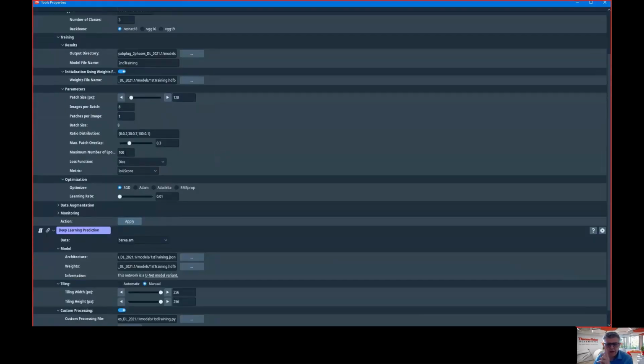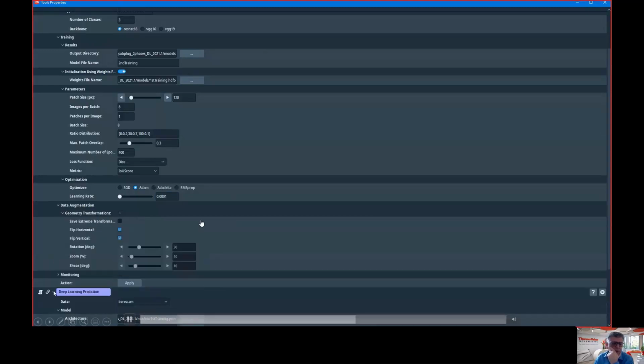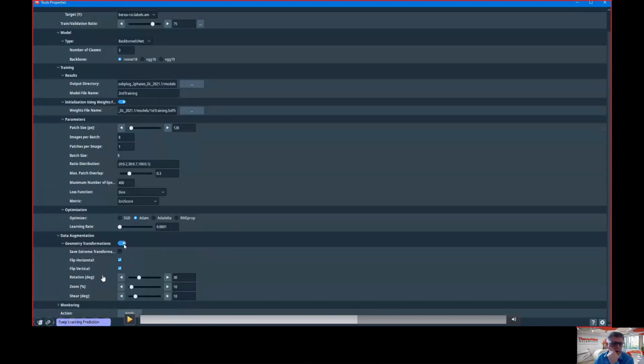So you have to master two steps in digital rock, in deep learning. And you will probably use a smaller learning rate. We also have data augmentation, for people that know what it is. I'll try to quickly explain.